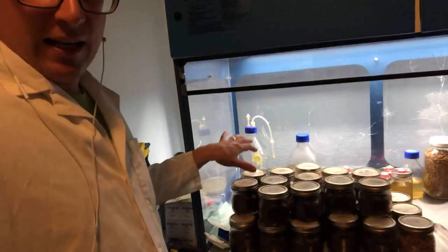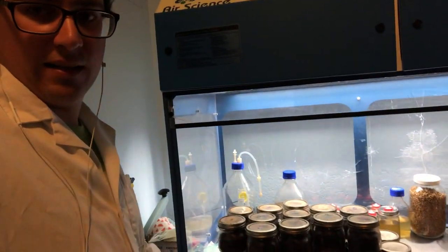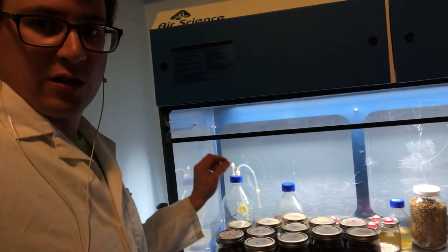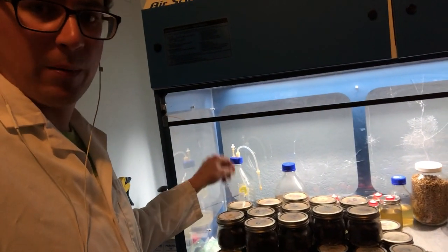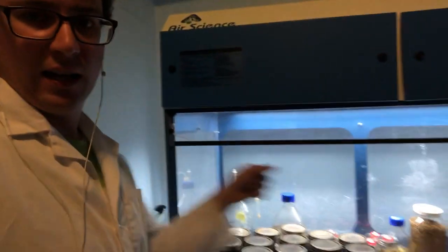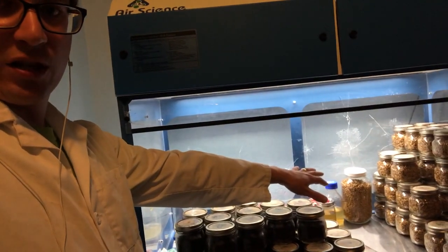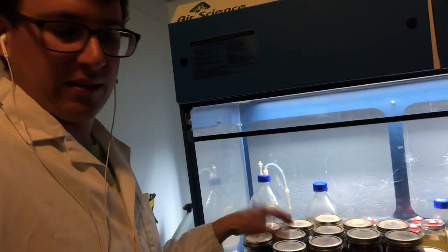A couple other ideas I have that I'm going to be working on shortly is the implementation of a peristaltic pump. So you can automate this process using a peristaltic pump and possibly a needle to extract into some of the lids that I just produced for sterilization purposes.